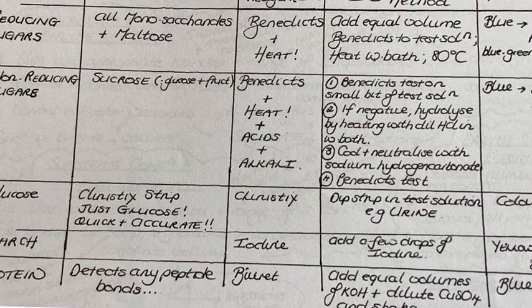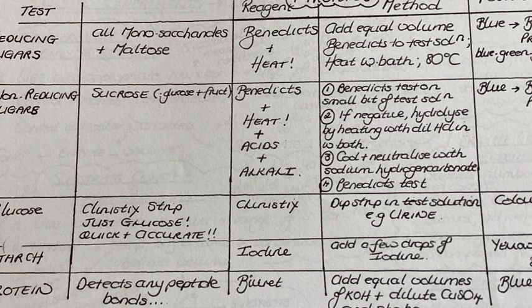So imagine you have a solution that you think is sugar, and you carry out the Benedict's test on a bit of this test solution, and it is negative. It still might be sugar. But what you have to do is you need to hydrolyze it. Now, in this case, when the sucrose is hydrolyzed, it breaks down into glucose and fructose. So you need to be able to describe how you would hydrolyze sucrose. So you hydrolyze sucrose by heating it in a boiling tube with dilute hydrochloric acid in a water bath.